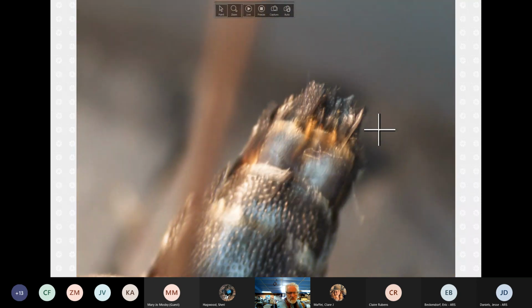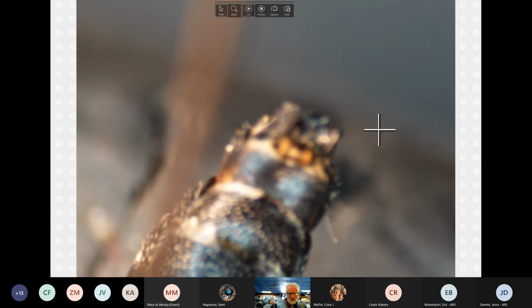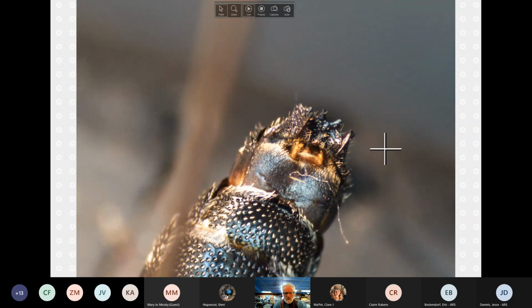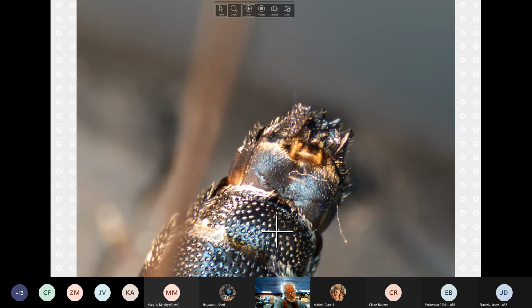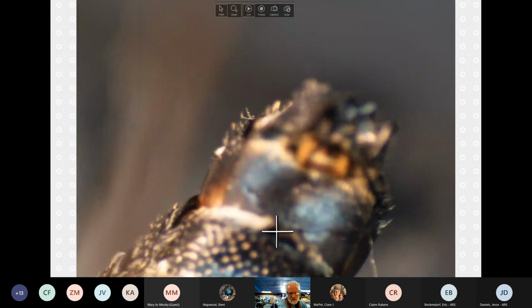Now we're looking at the sternites. That wasn't used in this particular characters, but if you recall, we had torn off sternites in the last one. So here's the genitalia picking out. Here's the architecture of the back end. This should be S6, 5, and 4. So if we look, these two, 4 and 5, have this interesting stuff that are useful. So if we go in a little bit more, we can kind of see on S5.